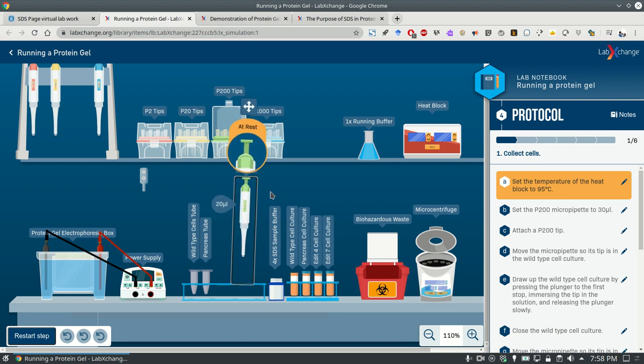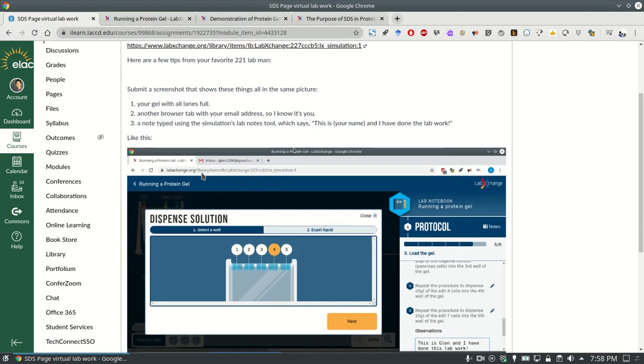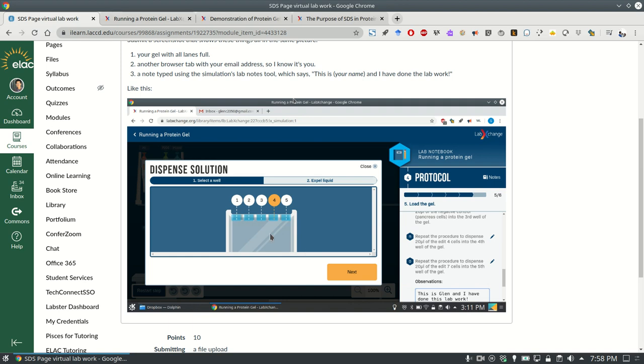So that's it. Yes. One more thing. You're going to need to give me a screenshot. Your screenshot should be just like this. It's got to show me that you've got all these things. You got to type me a little message here. "This is Glenn," or "This is," who are you? Are you Jan? "This is Jan," or whoever you are, right?